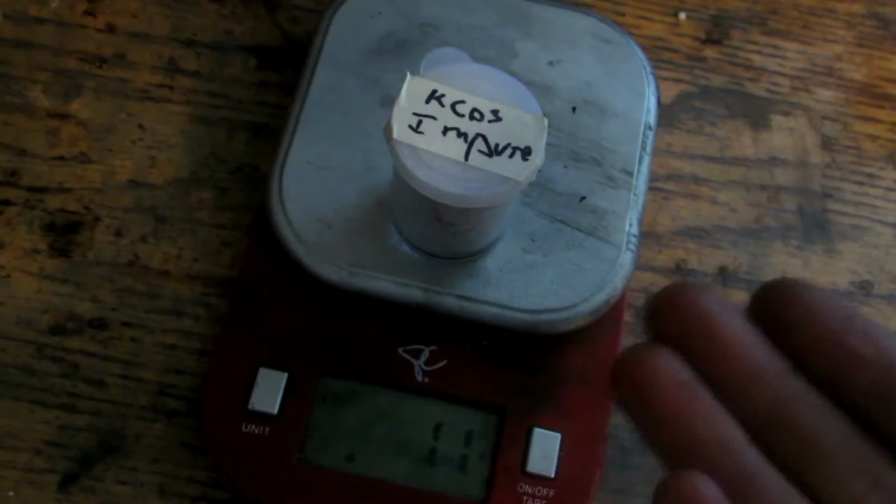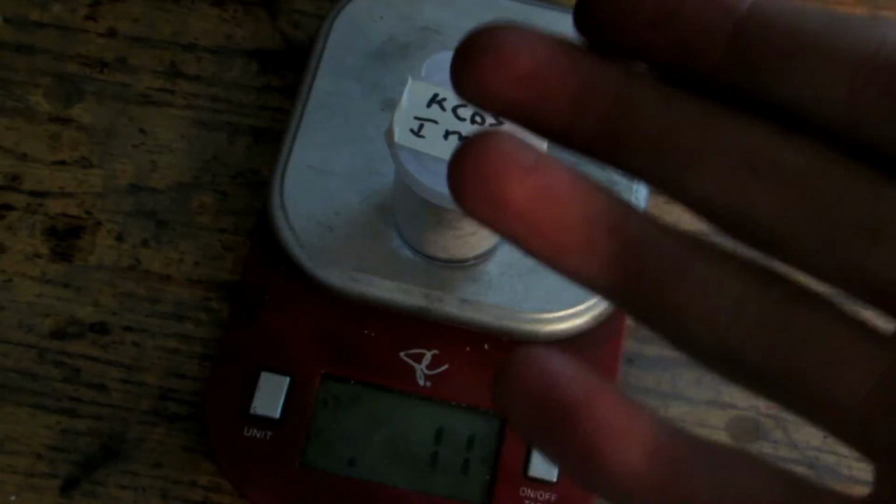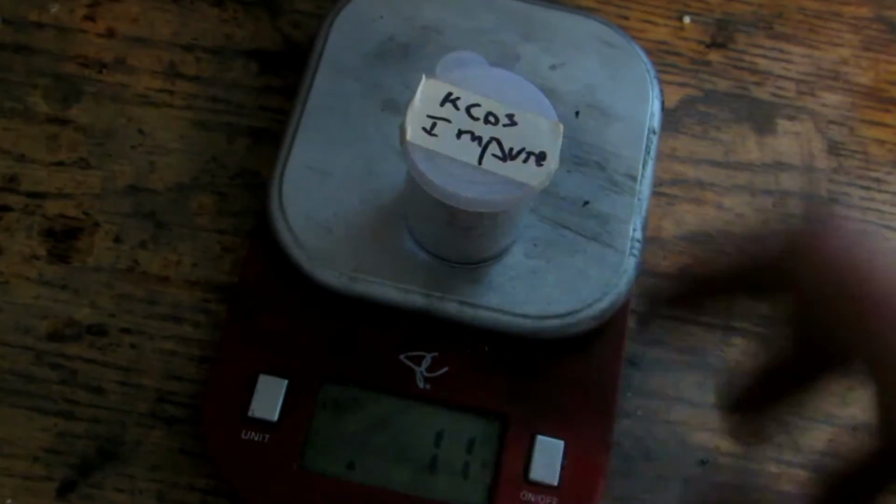Today we are going to be making a compound known as potassium hydroxide. Now in a previous video we made potassium carbonate, and this is my impure one of them, which means it's not totally pure. I used a pure source of it to make potassium hydroxide using calcium hydroxide, but I'm going to be doing a different method today.